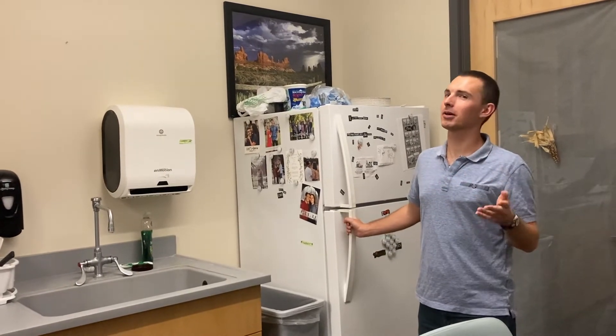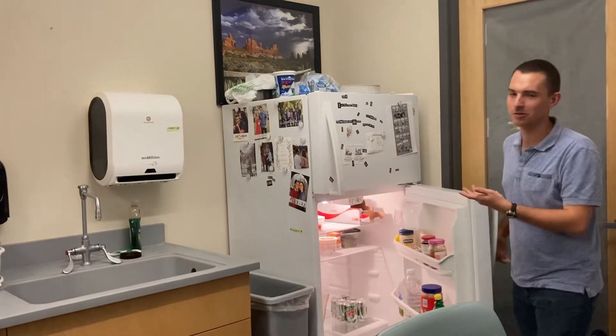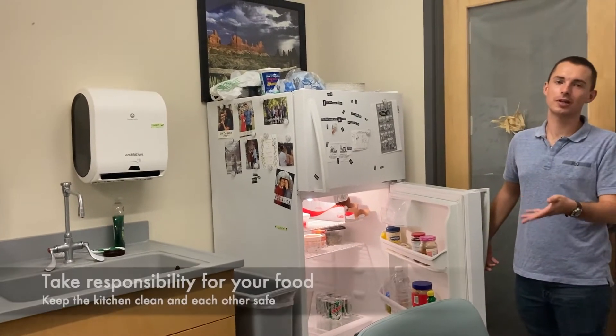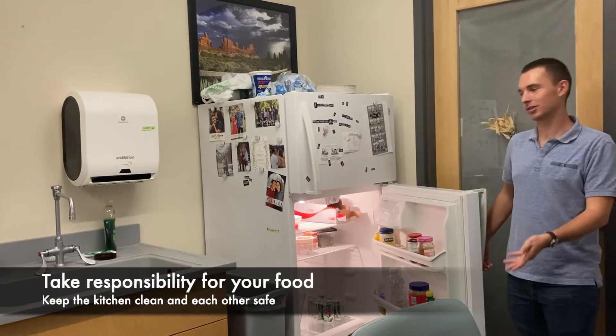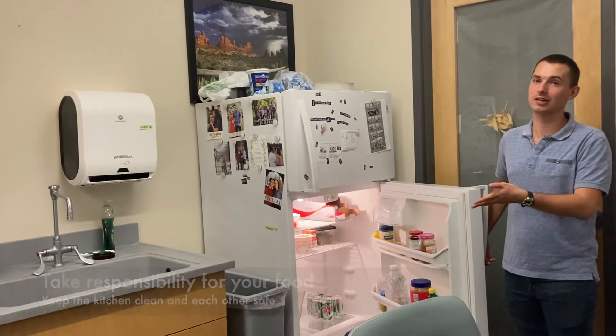However, courtesy and respect go a long way. Please don't leave food that's super old. And if it is yours, label it or take care of it. We don't want rotten and expired food, and we don't want anyone to eat it and get sick.